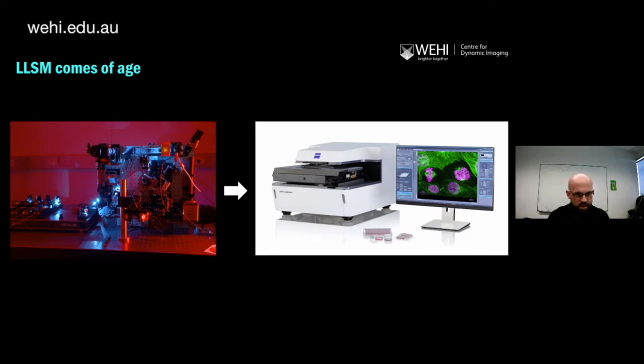So the biggest barrier to entry for the lattice has been the complexity in which interacting with the system has been. And, you know, it's not a conventional sample form. And so what Zeiss have done is they've turned the whole instrument upside down. And now you can approach it as if it was a confocal or a wide field. You can take any sample in a 96-well plate, 8-well chamber slide, dish, whatever, your standard format, just whack it on, press the button, go and come back. And this is fantastic. It's an absolute game changer.